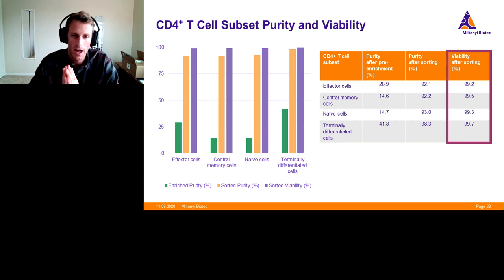I think as the field has seen these sort of new technology sorters come and go, there's always been drawbacks to using them, and most often they were issues with throughput or difficulty from an operator perspective, or they didn't have quite as many parameters that really stymied the ability of these instruments to really kind of influence the field at all.